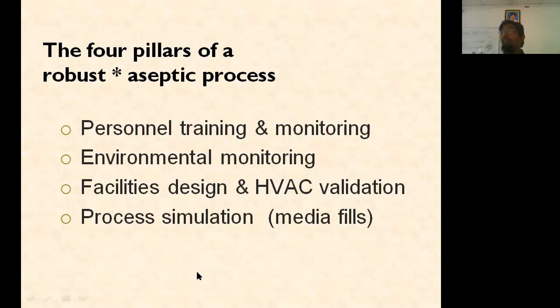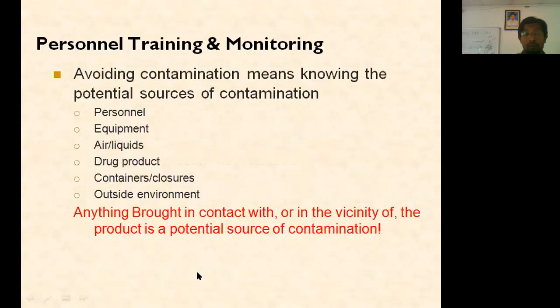So sterility checking should always be done of the air present there, the material present there, right? The containers present there, the working bench, everything, right? So you should take media fills, and every process should always be validated and simulated and checked whether it is sterile or not, right? Then these are the four basic pillars of aseptic processing, right?